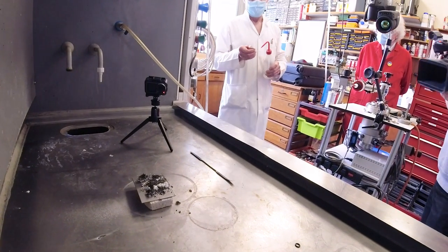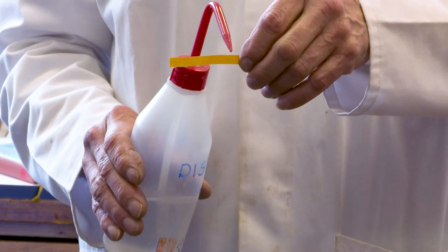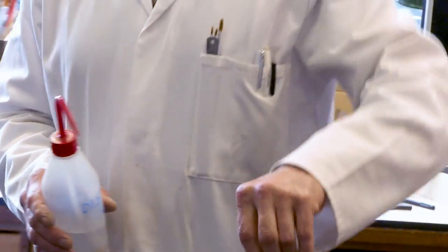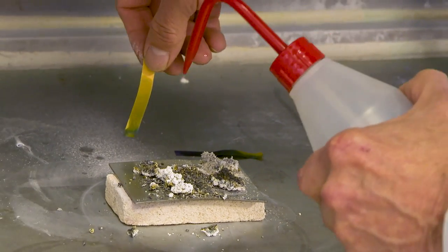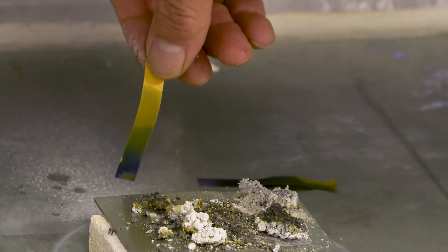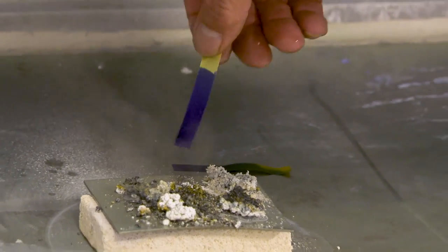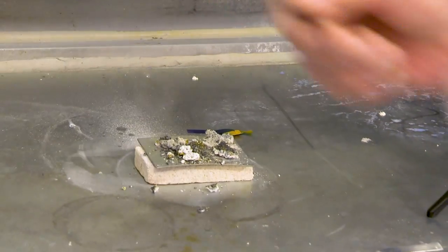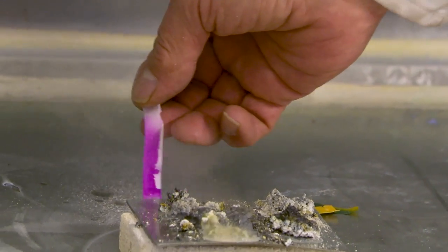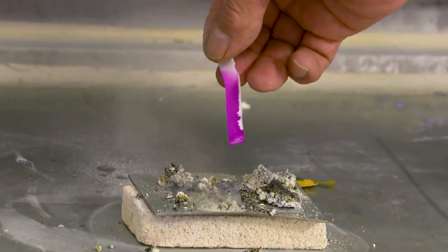Magnesium nitride reacts with water and forms ammonia, which as you know is a gas and is alkaline if it touches something that is wet. Neil tried indicator paper that goes a bluish colour when you have an alkali, and phenolphthalein paper which starts white and goes blood red — and they both worked.